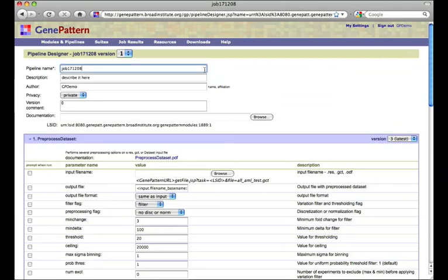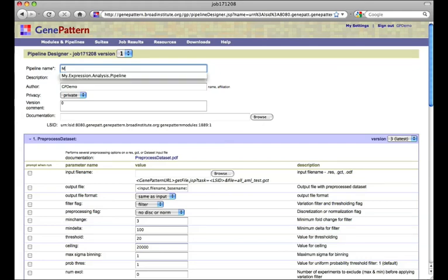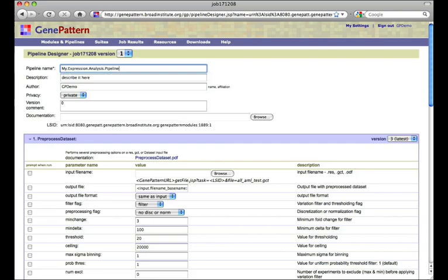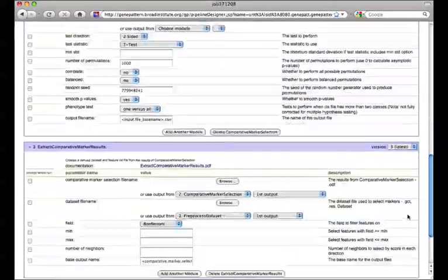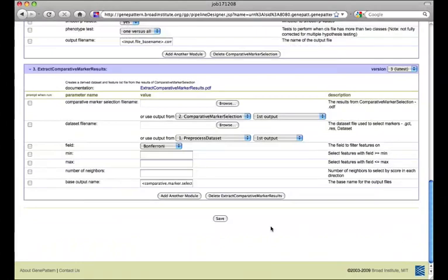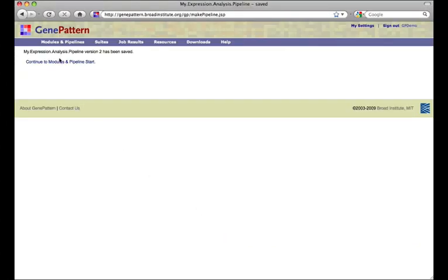By default, the name of the pipeline will be the ID of the job which contains the result file we used to create the pipeline. It would likely make sense to change this to something more meaningful. You may also wish to edit the other fields. Once you are done with those edits and have verified the settings in the pipeline, click Save.